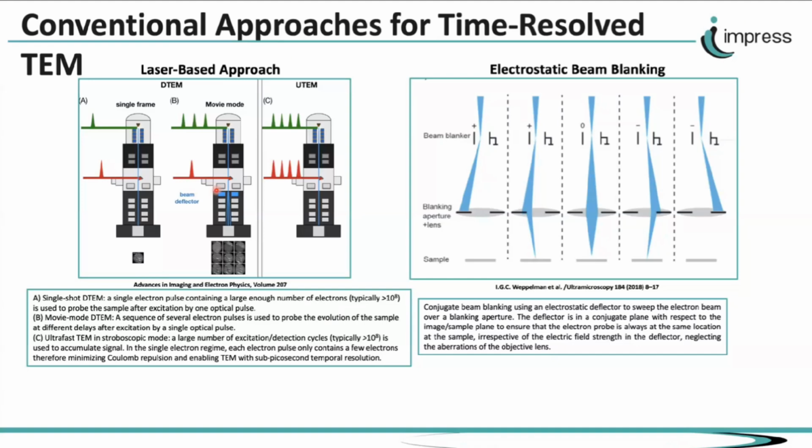For example, if you are studying crack growth, or a melting condition or nucleation, you can have snapshots, 9 or 16 images or frames, of the evolution of the specimen after the pulse.